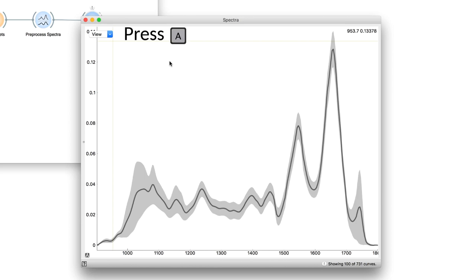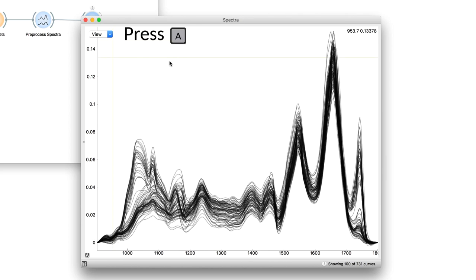What if we unclick averages? Nice! Now we see individual spectra.